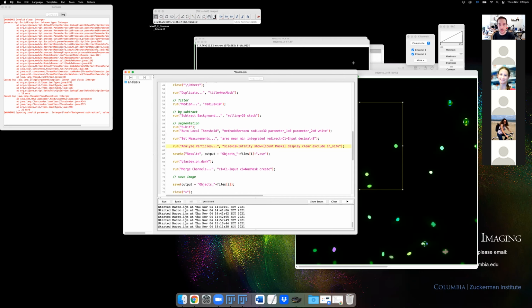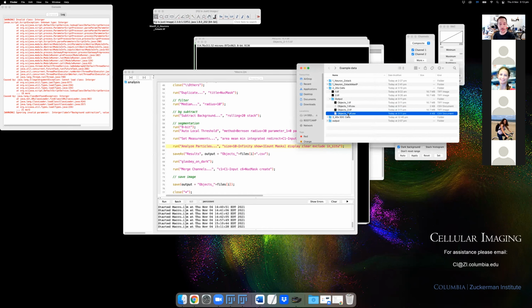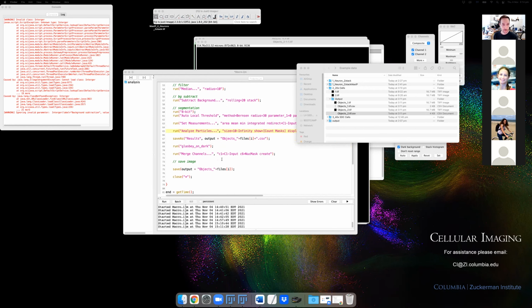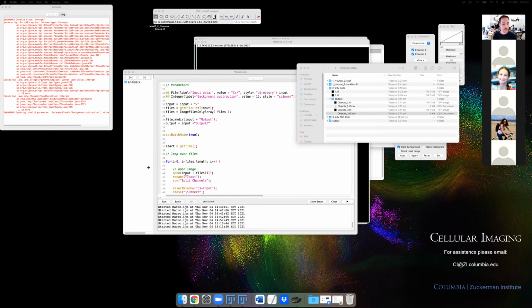This file name issue, it's not really an issue. There's no problem if you're running the script, you're still getting the files. But just so you have a good solution for future things, there's another function that is useful. I'm just going to put it in the chat. I use this just to clean the image title. It gets the image title, removes the file format at the end, and replaces any unusual pluses, minuses, anything that could be a problem in some of the programming that we do, and creates a clean file name. So you can just use that.